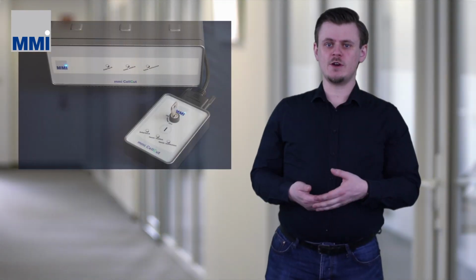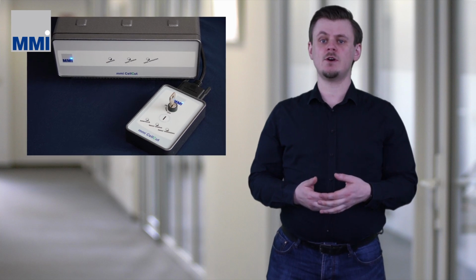In this video, we'll show you how to dissect samples from tissue and also how to collect them with the CapLift. You will learn about the multiple collection methods and about the predefined target positioning, or short PTP.